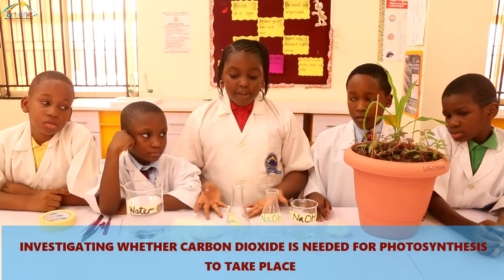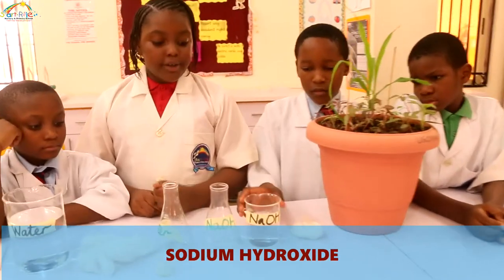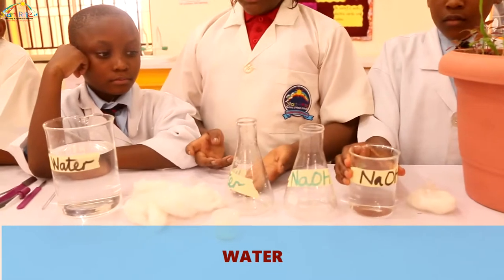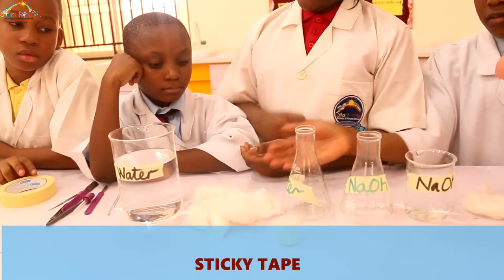The things needed for this experiment are: a plant, sodium hydroxide, water, cotton wool, and also sticky tape.